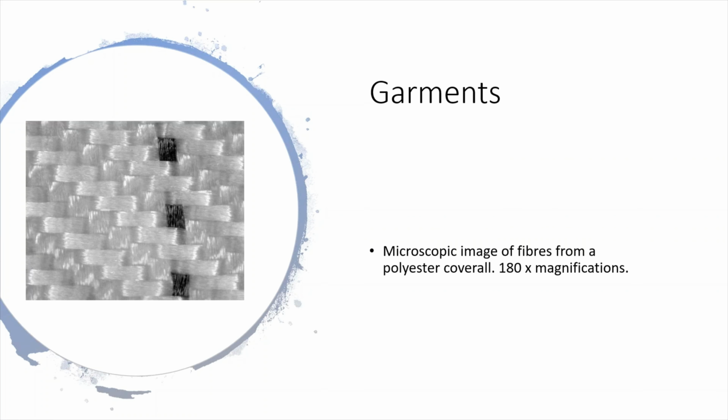But towards another extreme, the ability of that gown to filter out bacteria and fungi but still allow sufficient air passage might be too weak. So understanding that, making sure that operators are comfortable but we do have the best filter efficiency is a really important choice to make. And those of you who are microbiologists need to understand what the filter efficiency of your gowns are.